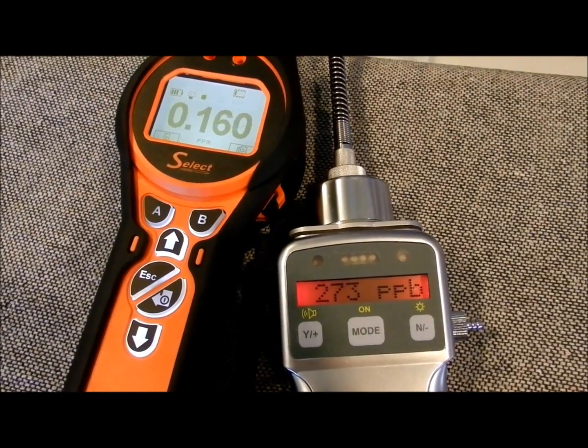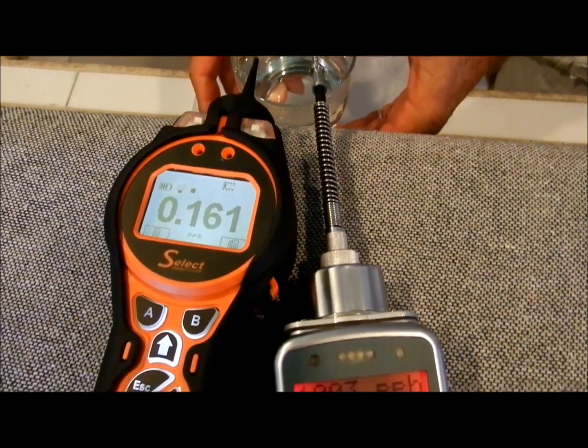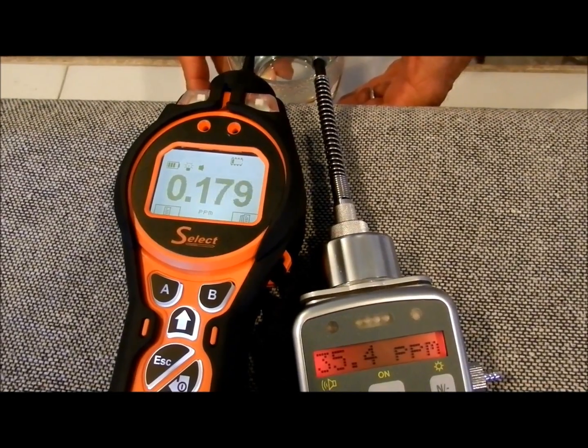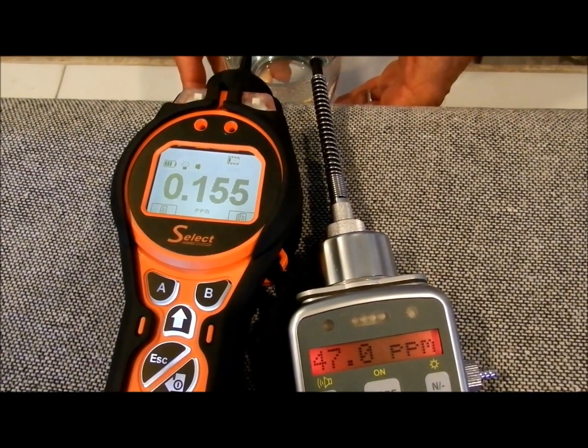You can see that the readings are roughly the same in indoor air, but when we apply water vapor to them, the readings on the PPB Ray shoot up, but the fence electrode on the Tiger Select keeps the readings in a reasonable range.